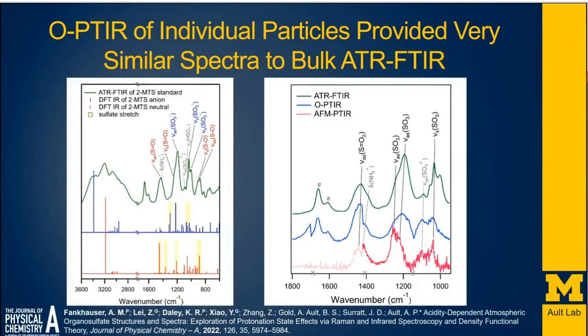And so what we also did is we compared what we got with that ATR-FTIR with aerosolized particles that we looked at with both the optical photothermal infrared as well as the AFM-PTIR that I mentioned before. And the blue trace here for the optical photothermal, and this was, I should say, published in Fankhauser et al.